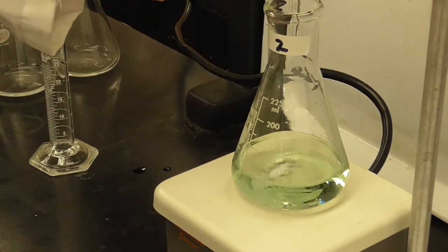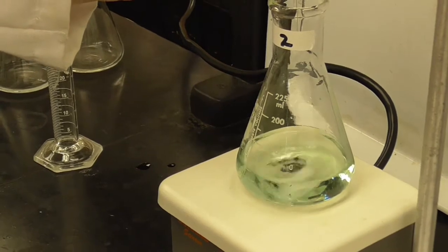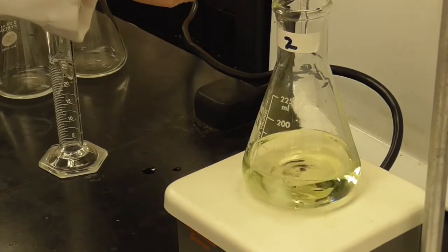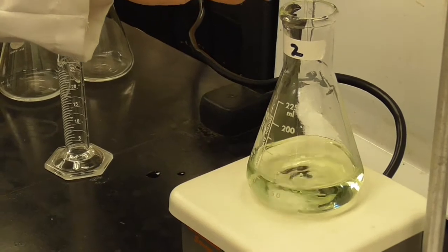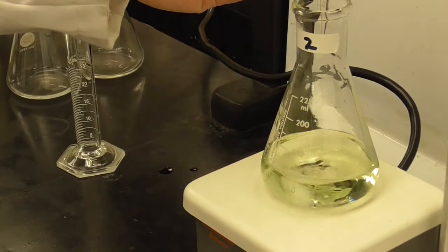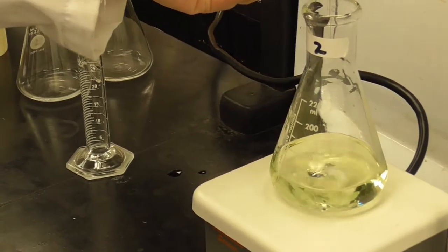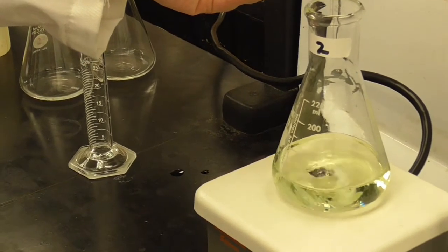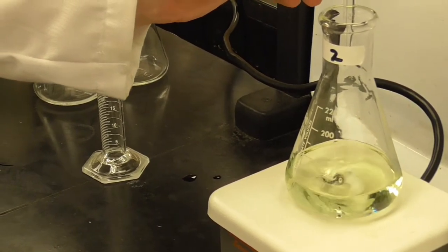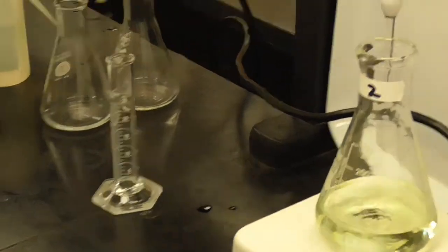And let's see if that's that. It went back to green. Green. There's yellow. Kind of went back to green. And there's yellow. I would go one more drop. Maybe one more drop. Okay, that's staying yellow.